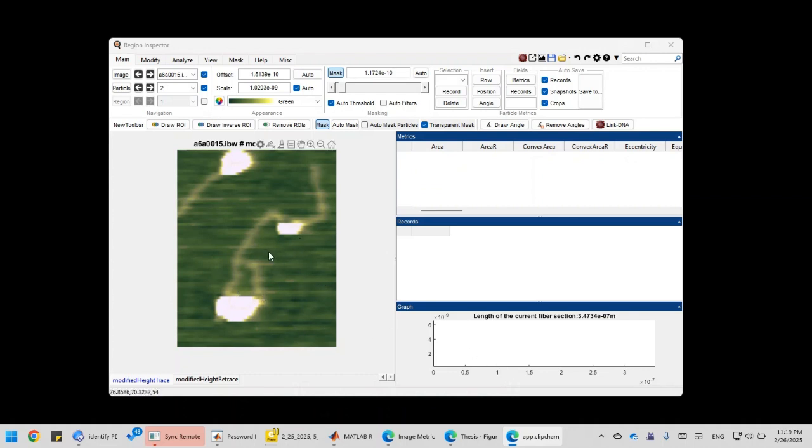So we have a complicated protein DNA complex here, and there could be multiple ways to dissect this molecule. One way is that it's two DNA molecules that are linked at the end here. As you see, there's a little bit of extension of this DNA, and that could be the end of this DNA molecule, and that could be another DNA molecule that just hides beneath this joint complex, right?